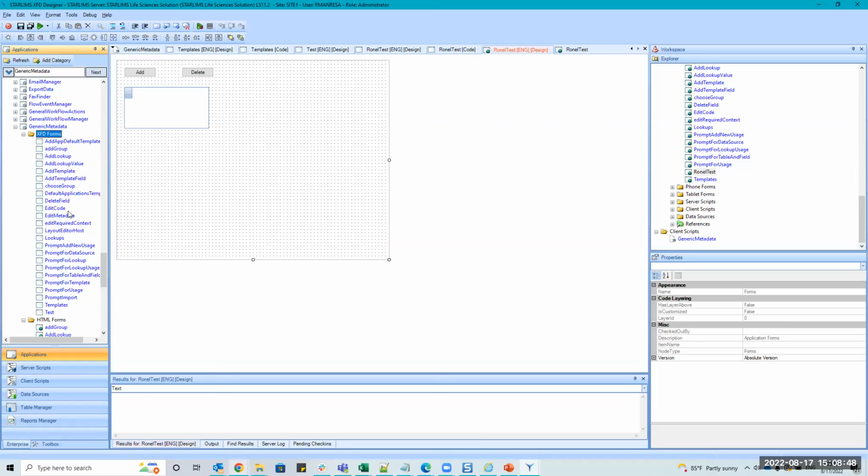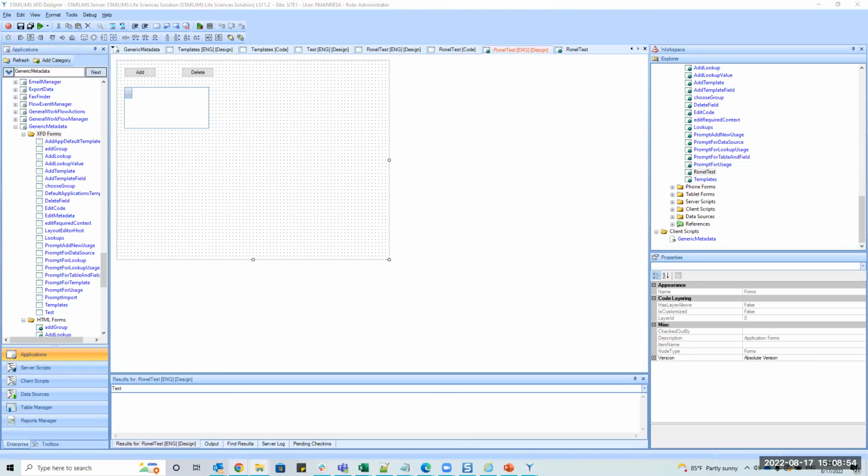I know it's, you know. Ronald? Yeah, I have a question. When you talk about this .NET, is it like a desktop application, or what does it mean? I'm not very clear. So say the question again. When I talk about what?